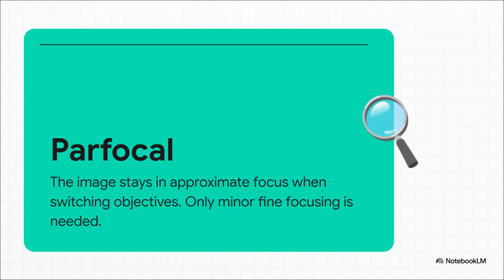Now here's a word you absolutely have to know for your quiz, parfocal. This is an awesome feature on modern microscopes.